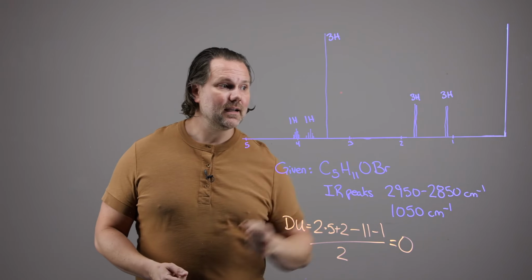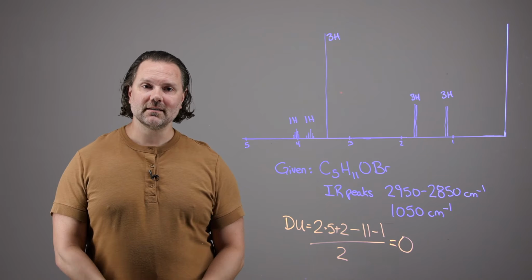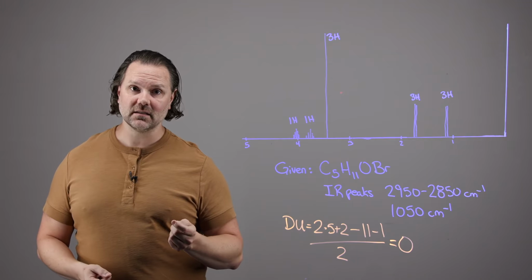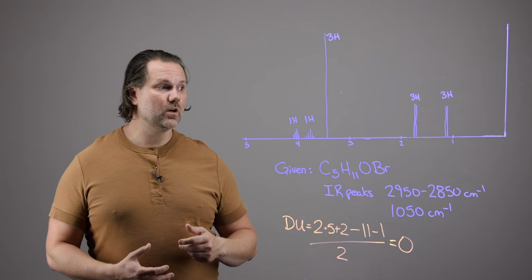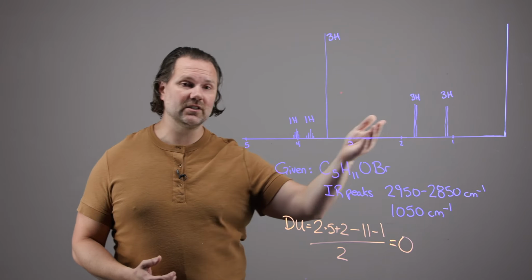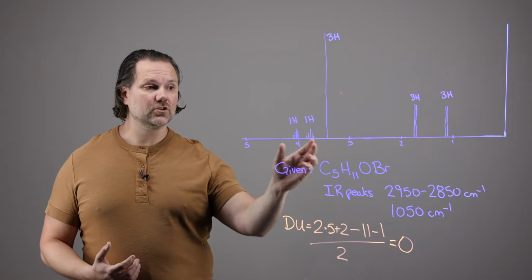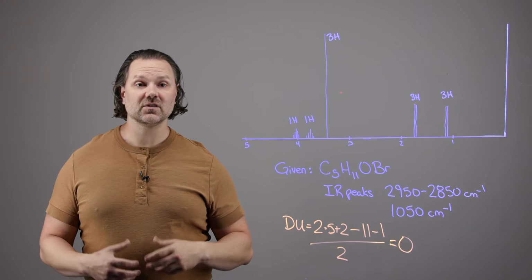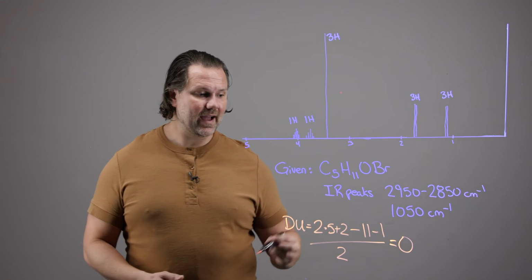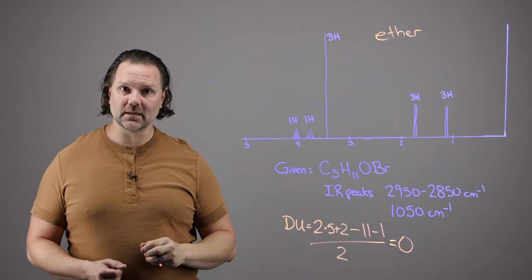Now we look at that NMR spectrum. Do you see an alcohol present? Remember, if an alcohol is there, we're going to see it showing up as a singlet with integration of 1 somewhere between 0.5 and 5 ppm. So we have integrations given to us, and the only signals that have an integration of 1 hydrogen are showing up as multiplets. So there isn't an alcohol present. That gives us a really strong signal that we have an ether that we're trying to assemble.